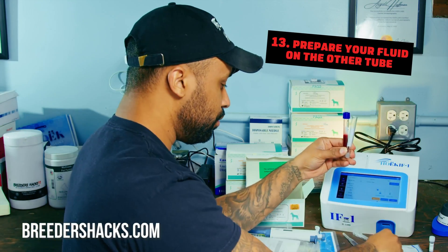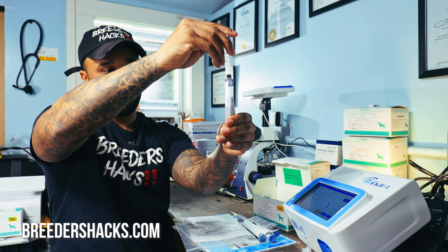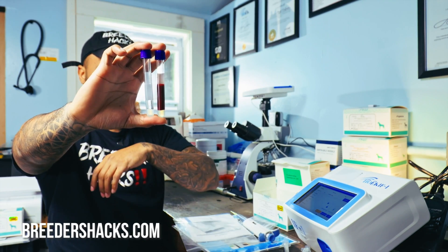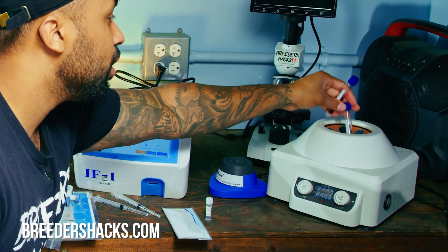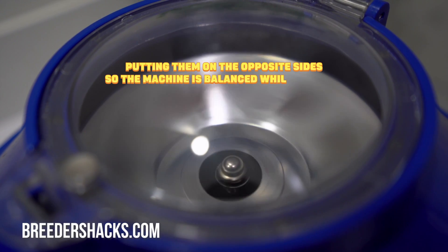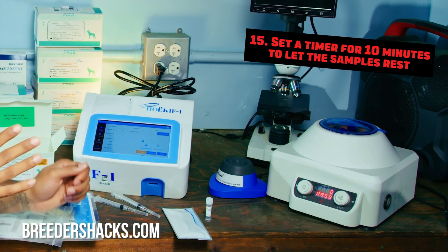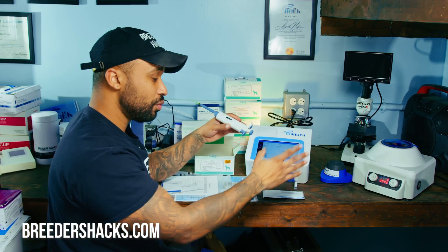Put in the exact same amount of water on the other side so both tubes have equal amounts of fluid. Once we've confirmed the two tubes are equally balanced, grab the centrifuge and place each tube directly opposite the other so the weight is balanced. Once this thing starts spinning so fast, it can break the machine if you don't have it properly balanced. Set the timer for about 10 minutes and let the blood sit to clot and coagulate before we even start spinning.